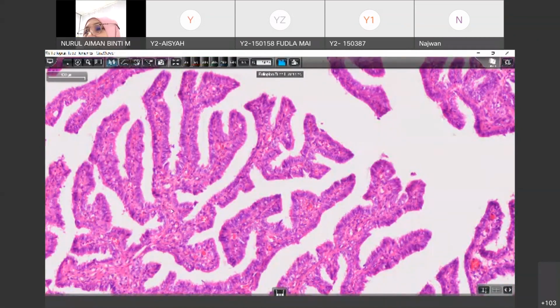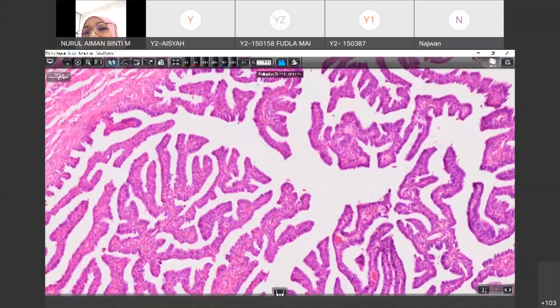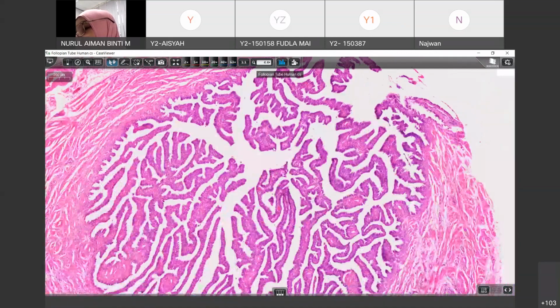of for what? It's the common site of fertilization. Yes, very good. Fertilization, because you can easily trap the oocyte here, the ovum. Okay, and it will be fertilized in this region and be carried towards the uterus.